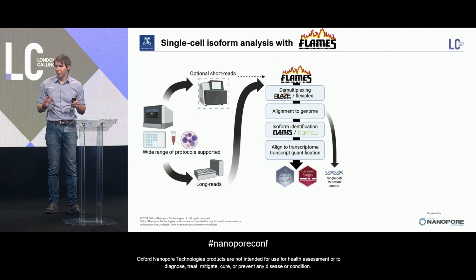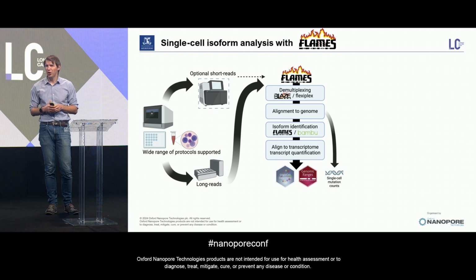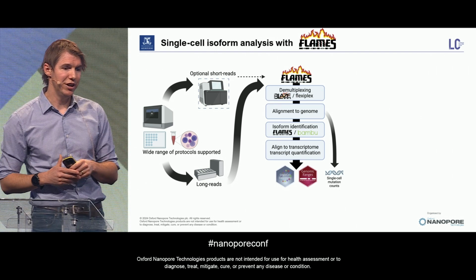And so just quick information about FLAMES. It's a pretty flexible software that you can use on quite a wide range of single-cell protocols. We usually use it for 10x, but it can be used on other protocols as well. You get your long reads. You can still do short reads if you want, but there isn't actually any need to.